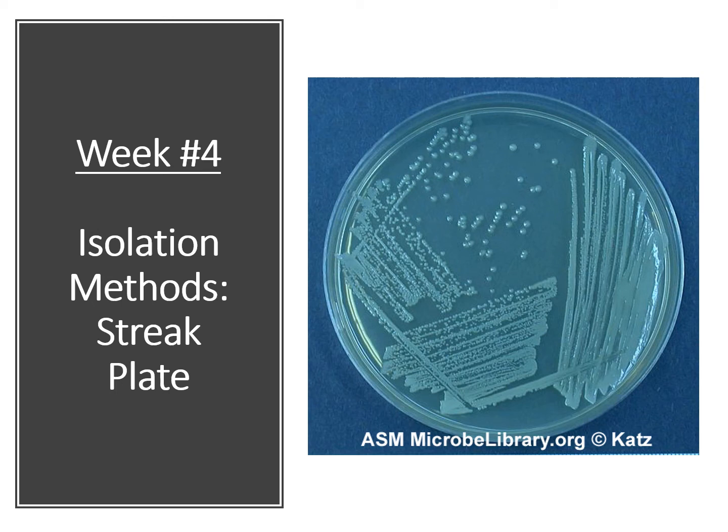Hello everyone! This week in lab we're going to talk about isolation methods, isolation of bacteria. In this PowerPoint we're going to focus on streak plates, and this is an image right here of a streak plate. A streak plate technique is basically used when we want to isolate a pure culture of bacteria. So let's say you have a mixed culture, basically a mixture of different species of bacteria, and you want to achieve a pure culture. We usually do a streak plate, and it will end up looking something like this.